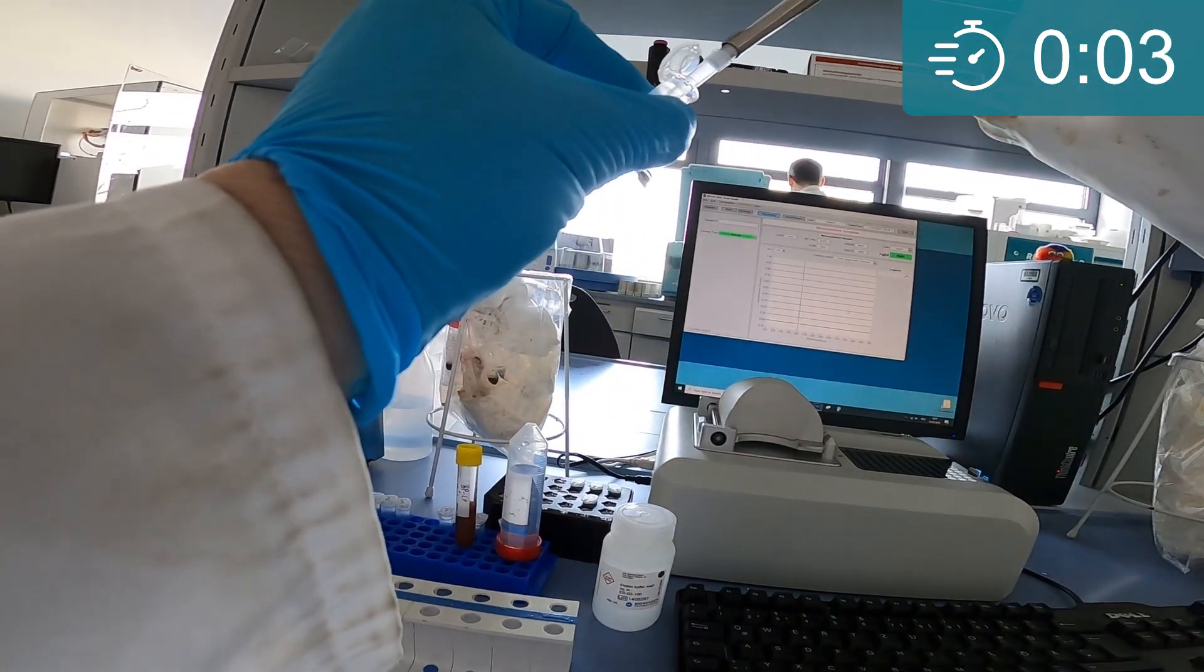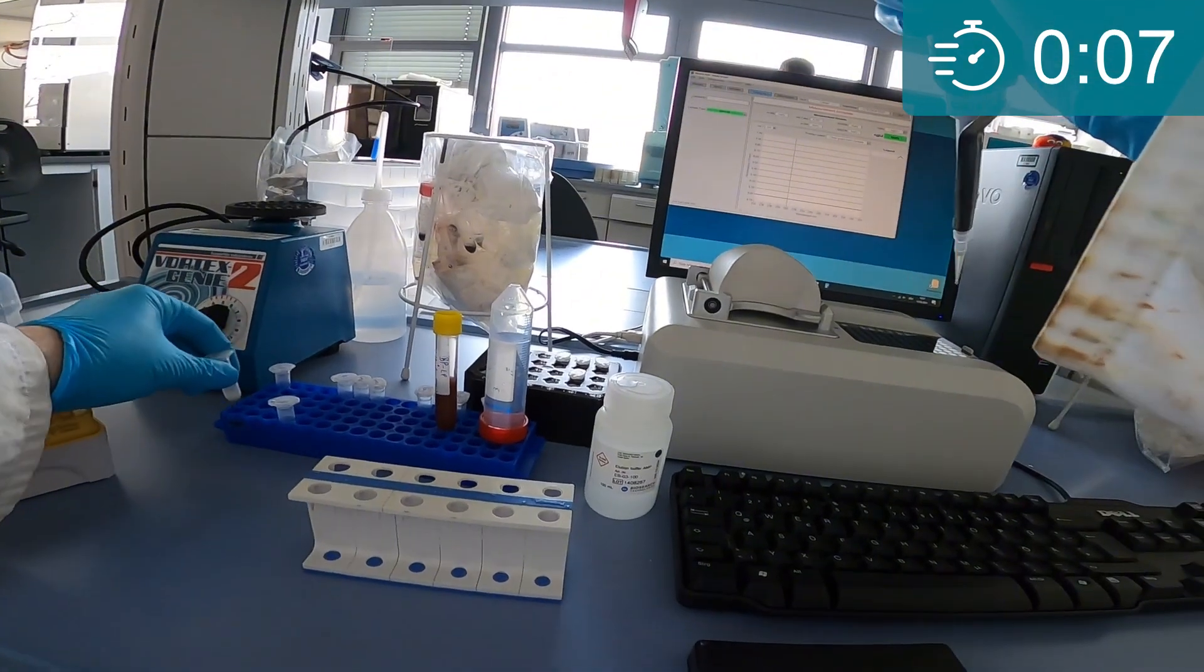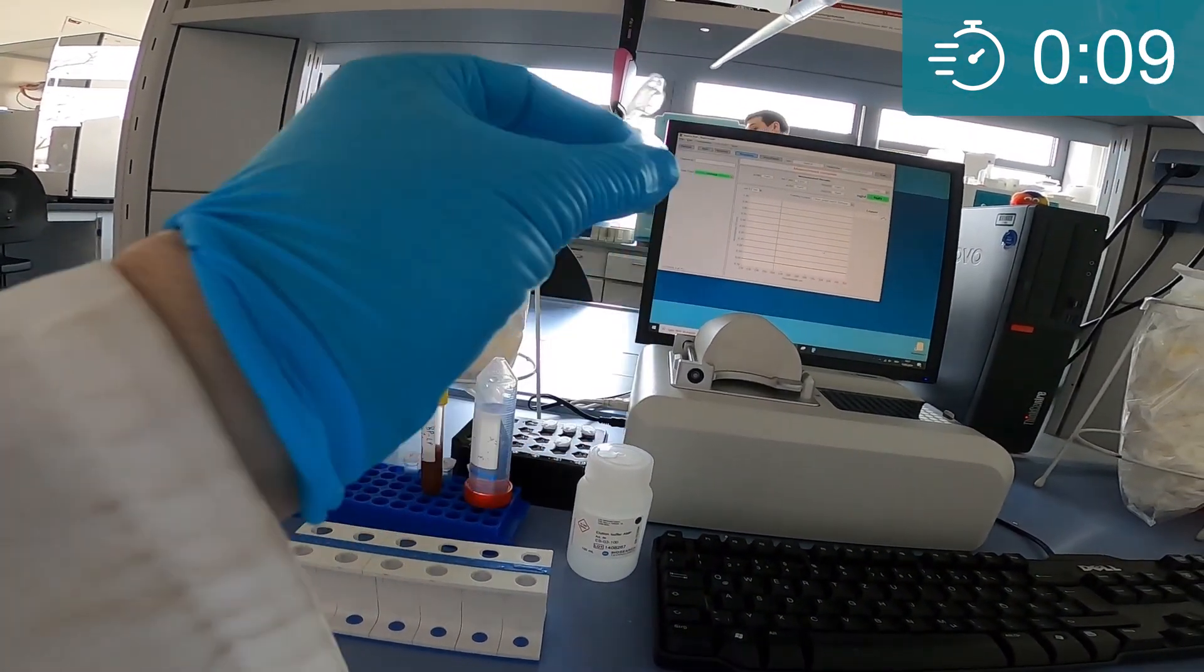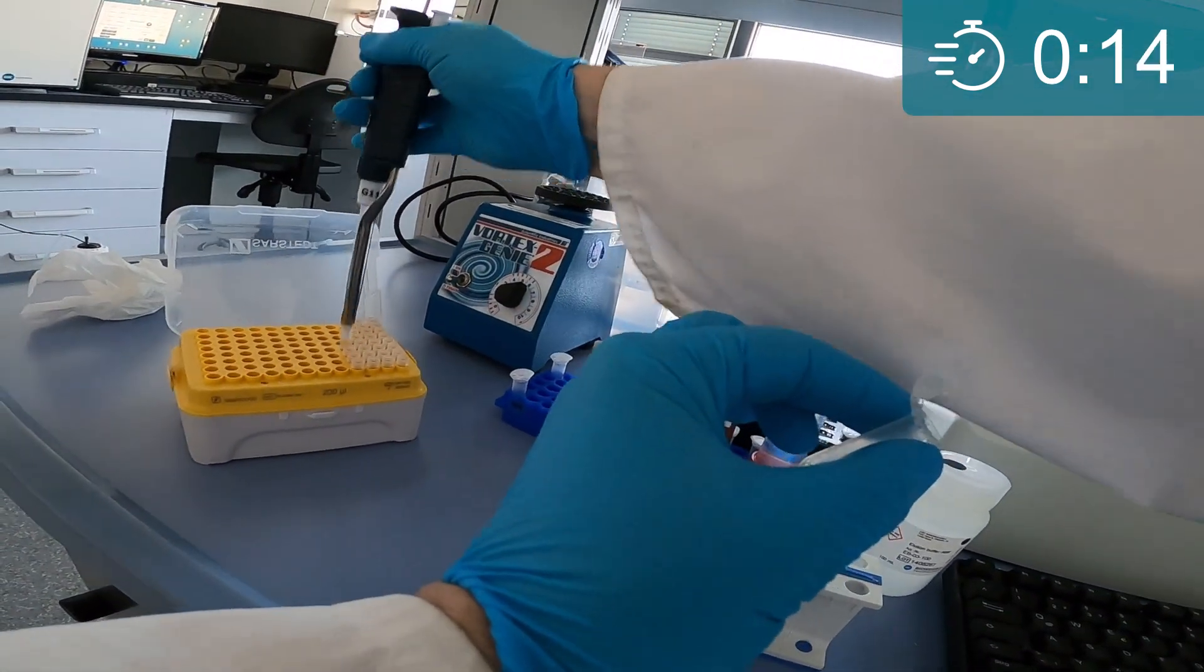The first step is to transfer the clear lysate, free of cell debris, to a new tube. The lysate contains the ground-up canola seed sample and one of our six novel lysis buffers.